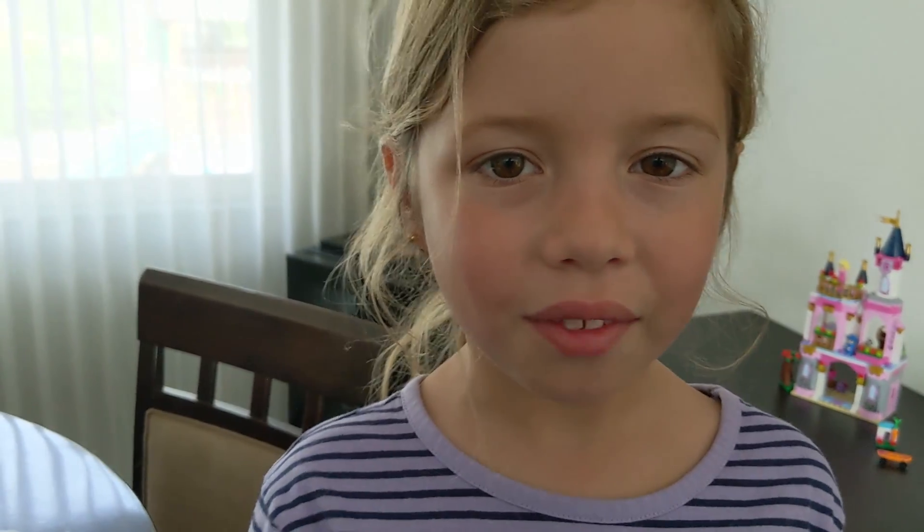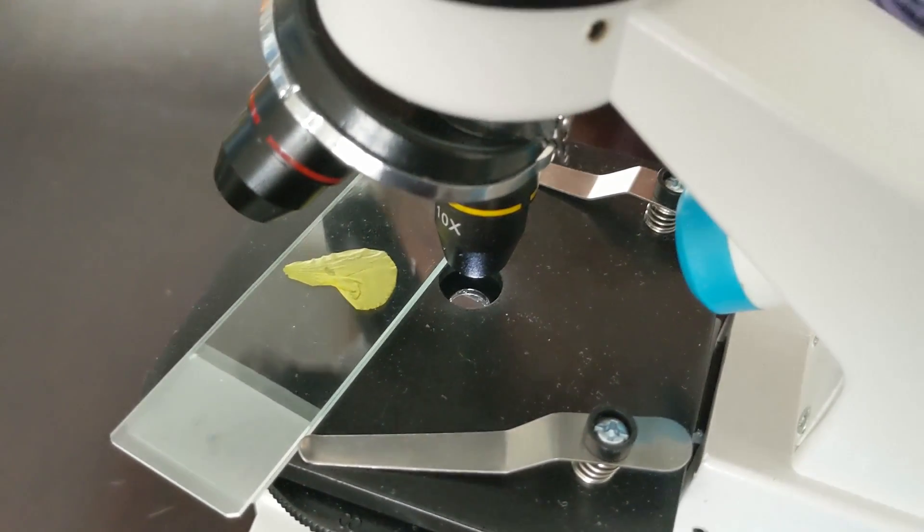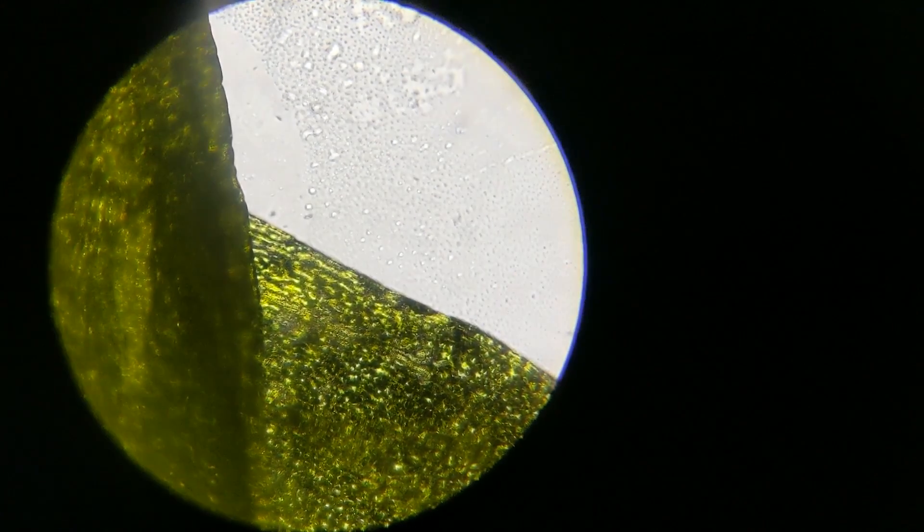It's time to check out the flower petal. For this, I trap the petal between two slides. In this one, you can actually see the cells of the plant.